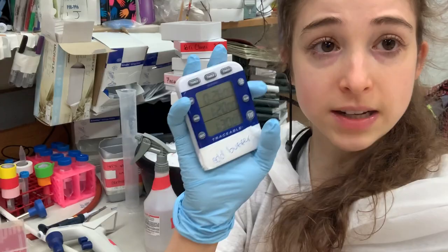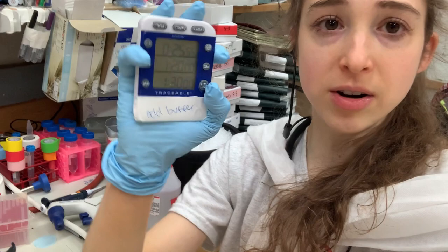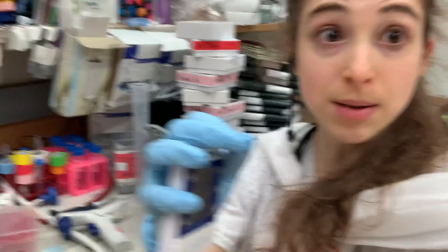Seriously, timers are so undervalued. One of the greatest things I got was this multi-channel timer that counts up and down. The only thing I want is a timer with like a five-second countdown before you start — you press the button and it counts down five, four, three, two, one. Because how are you supposed to simultaneously hold the tube, pipette, and press start at the same time? I don't have enough hands for that. So if anyone making these timers is listening — pretty please!